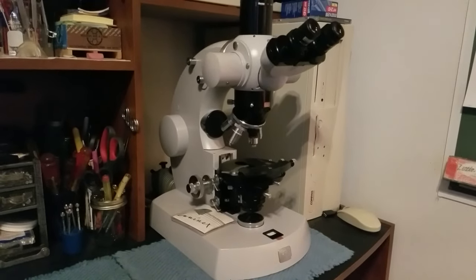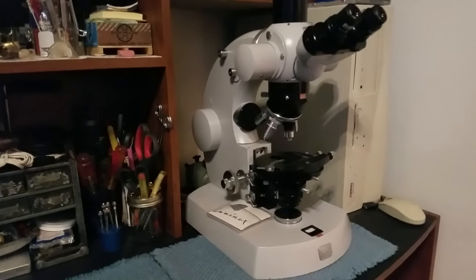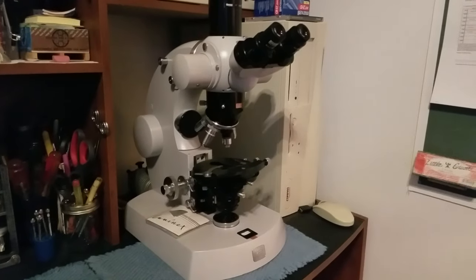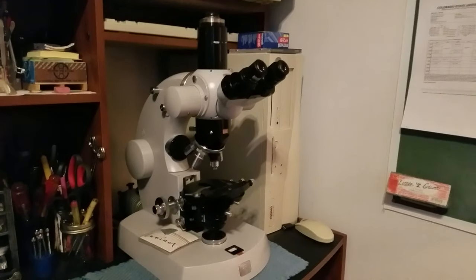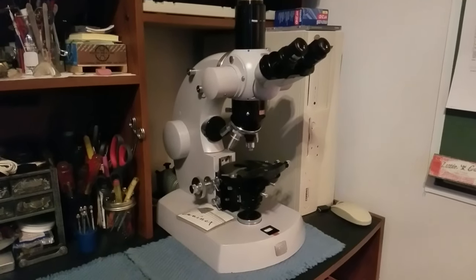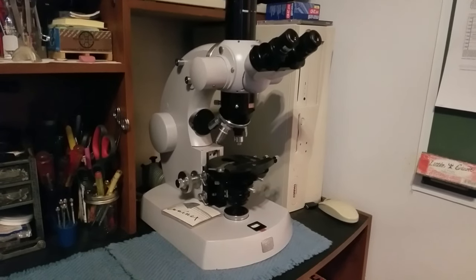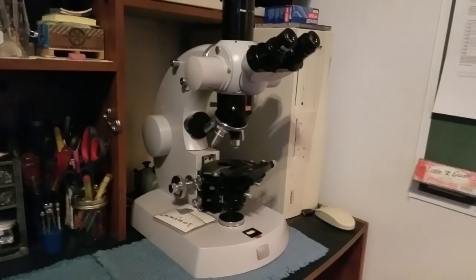I'm really excited because the controls work and this is in such good shape and working order. I can now say I have a fully complete photo microscope. I just wanted to give you guys the good news on that, since I mentioned in my first video that I didn't have the original power supply. Well, here it is — a big box that almost weighs as much as the microscope, about 50 pounds.